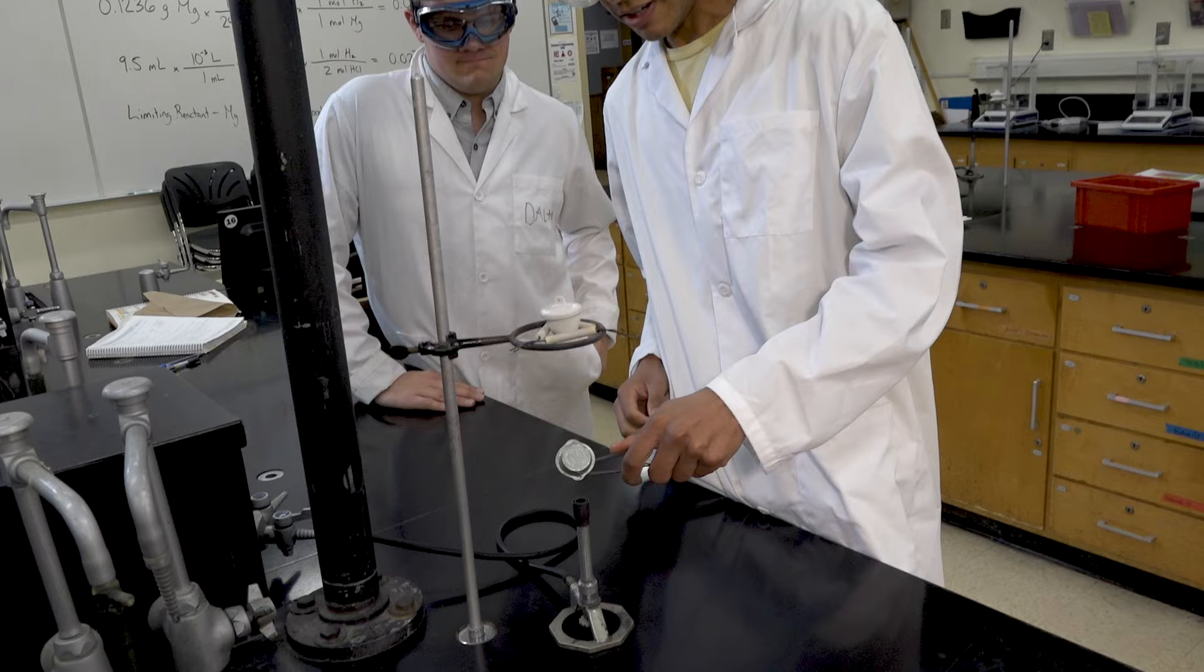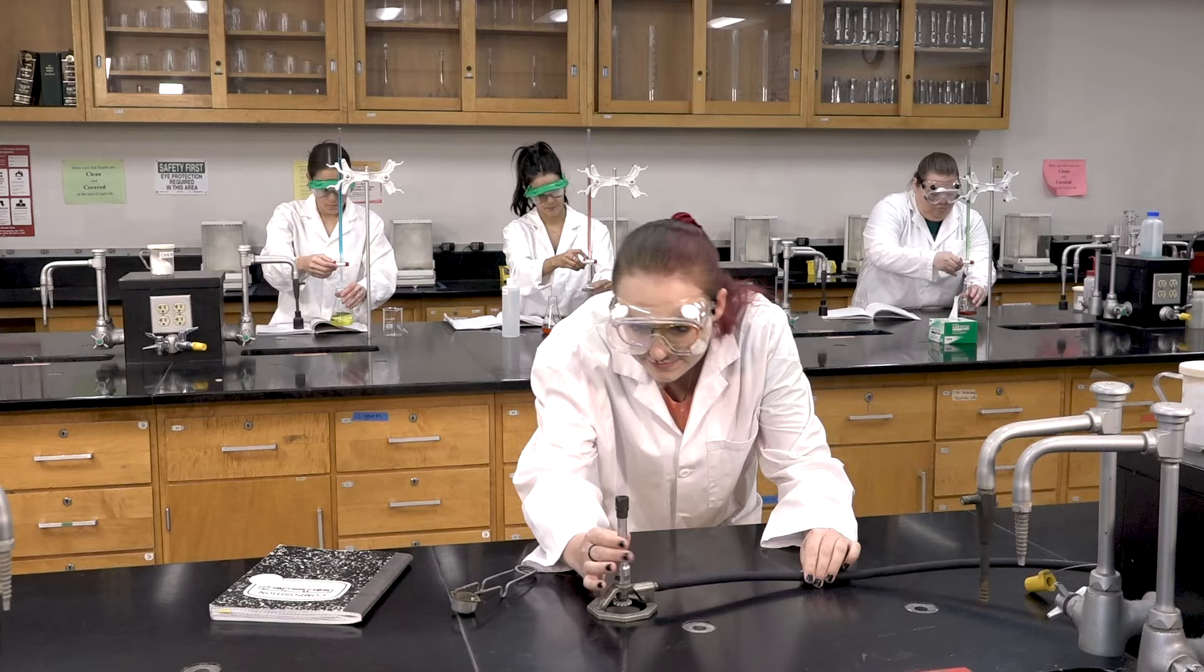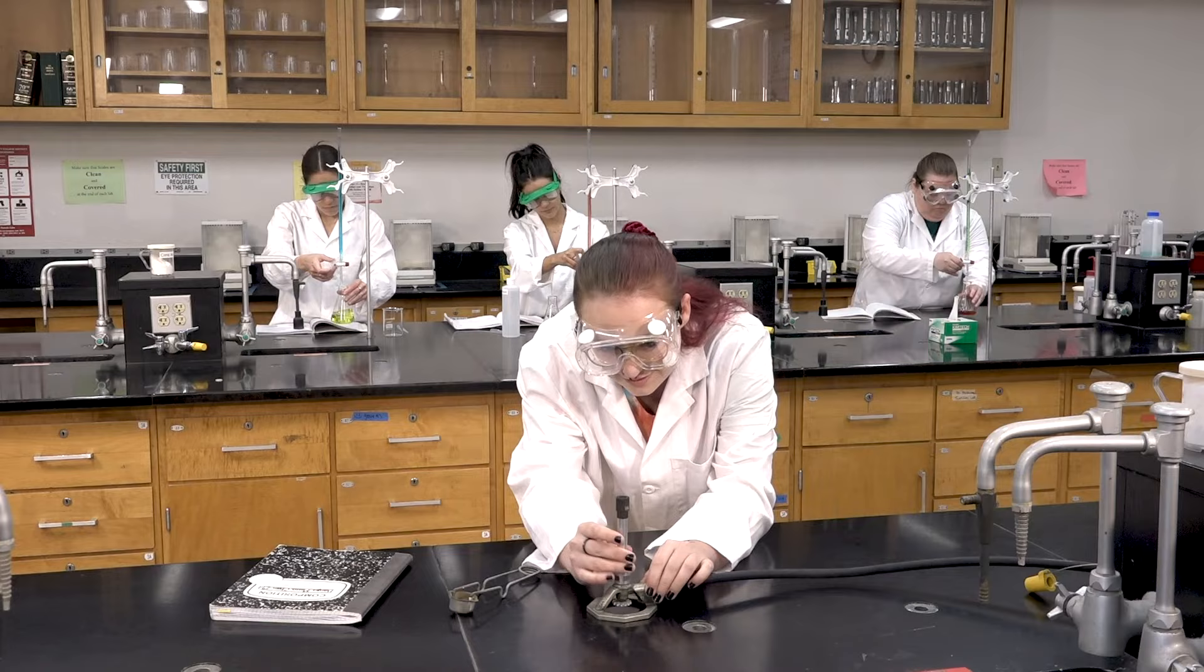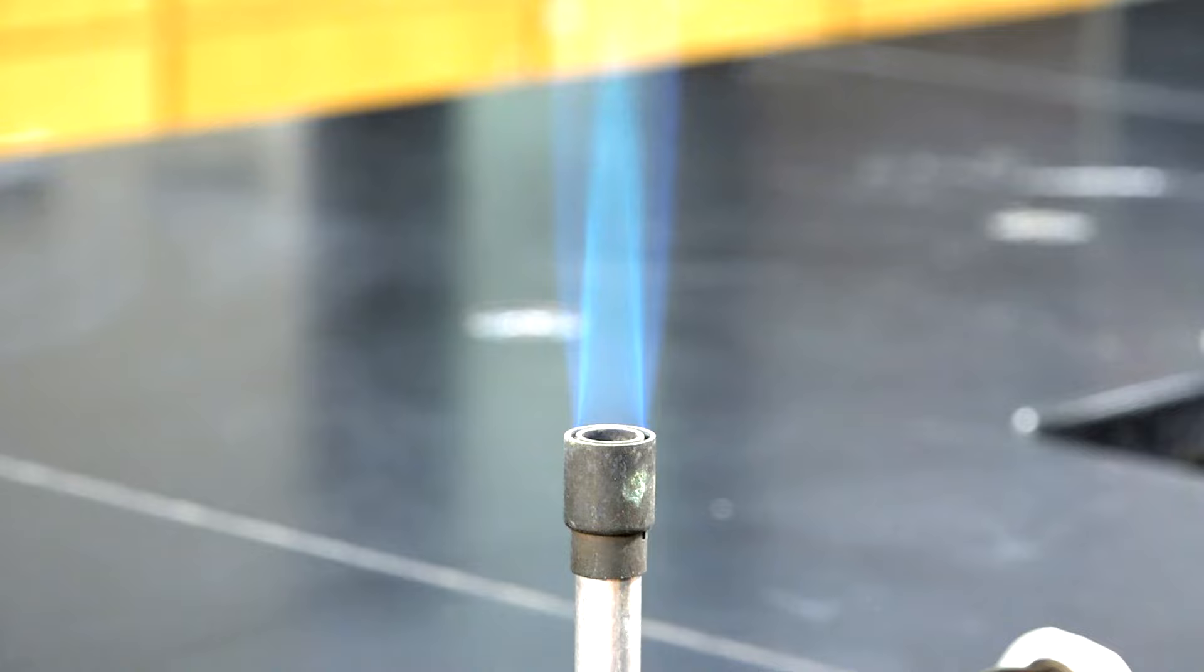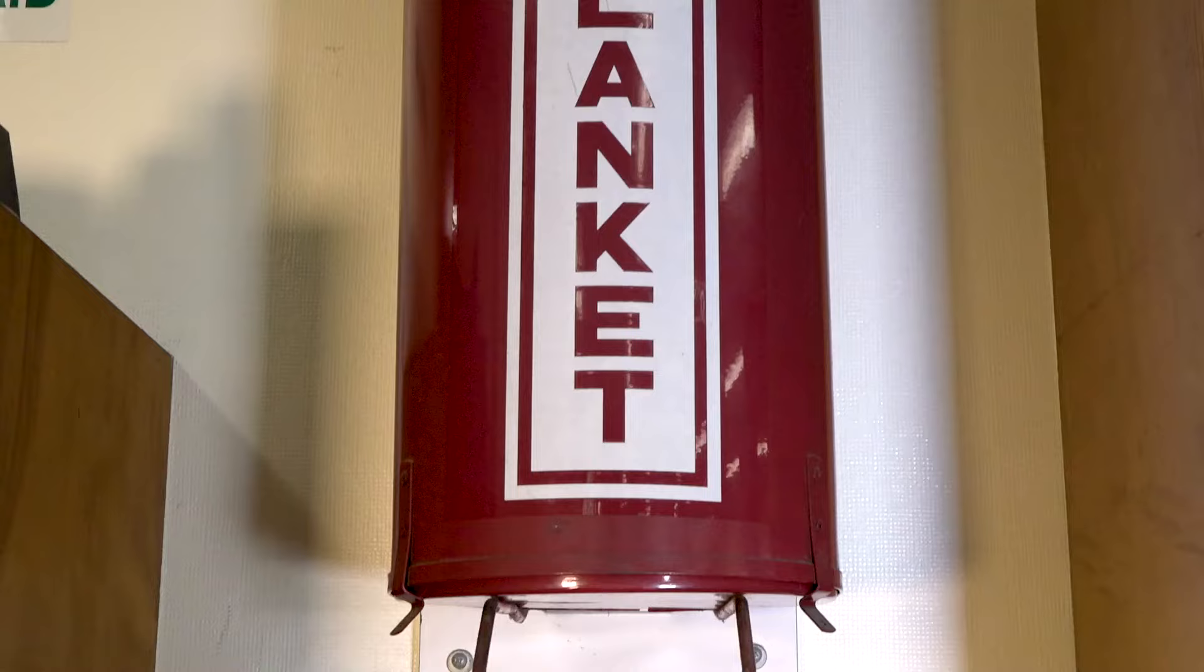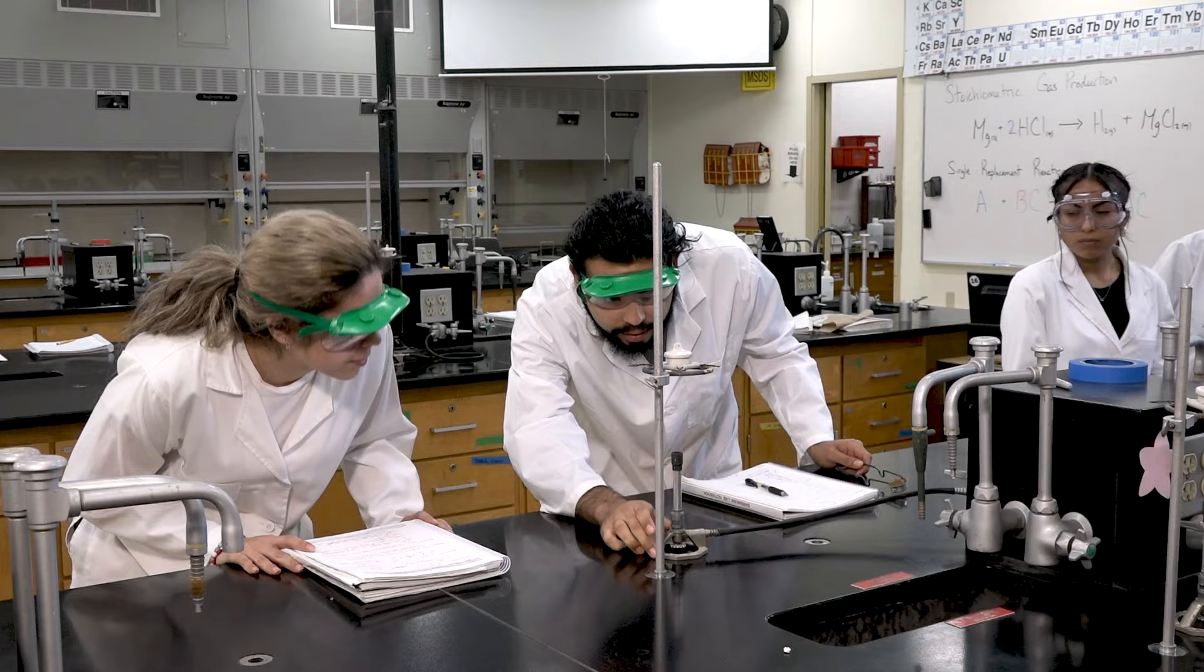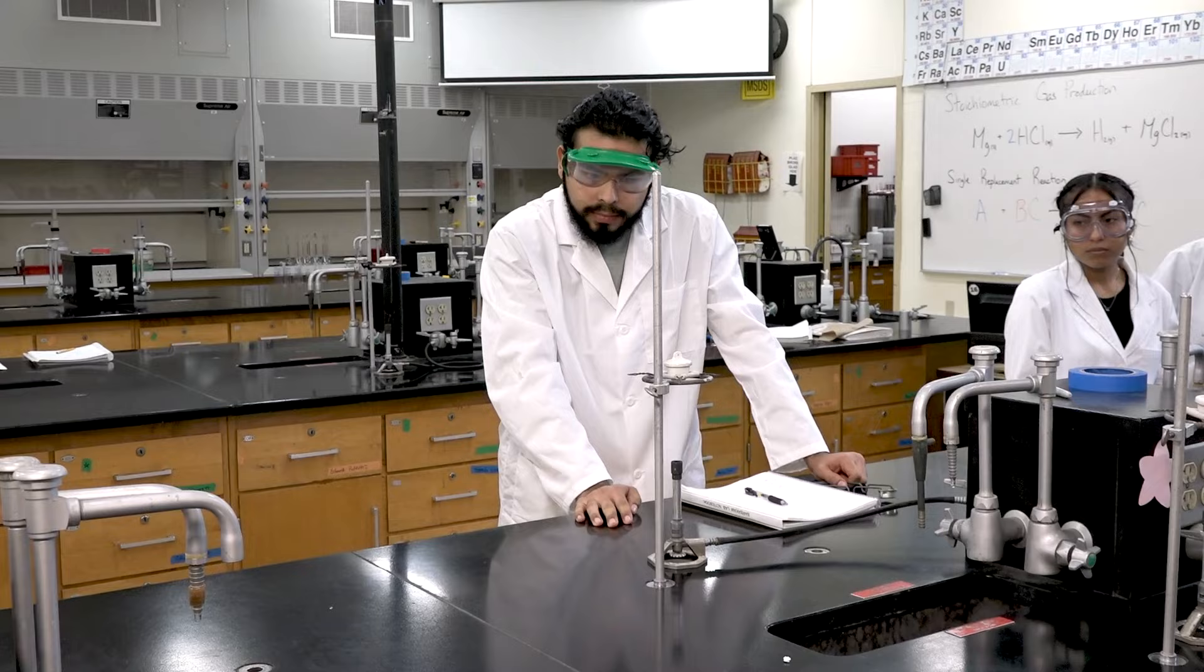A Bunsen burner is another common method for delivering heat to a sample in a chemistry lab. There is a knob on the bottom that adjusts the fuel flow, and twisting the column adjusts the air flow. Your instructor will demonstrate how to adjust these settings to obtain the optimal blue cone flame. Because of the open flame of a Bunsen burner, it poses a serious fire risk, so make note of where the fire extinguisher and fire blanket are in your laboratory classroom. When operating a Bunsen burner, always remember: Bunsen burners need babysitters. That is, you never walk away from a Bunsen burner when it's on. You need to watch your Bunsen burner at all times during its operation.